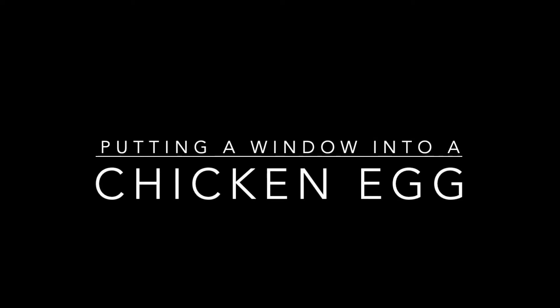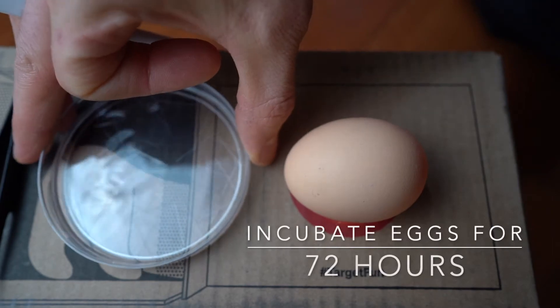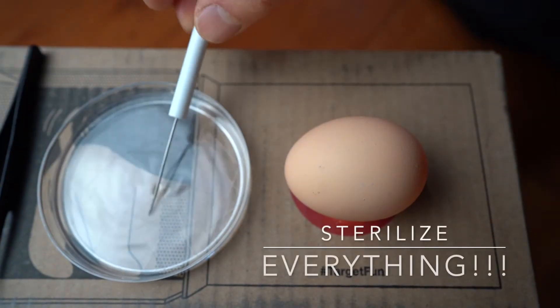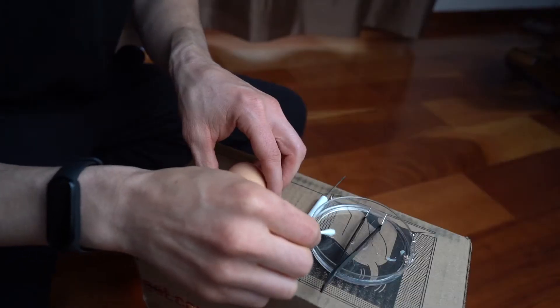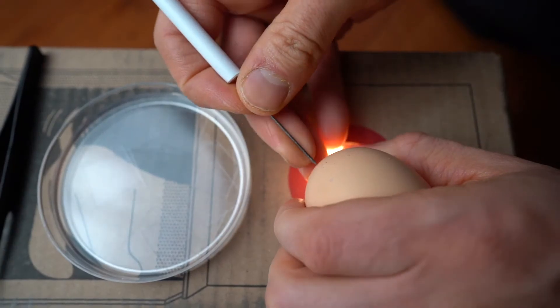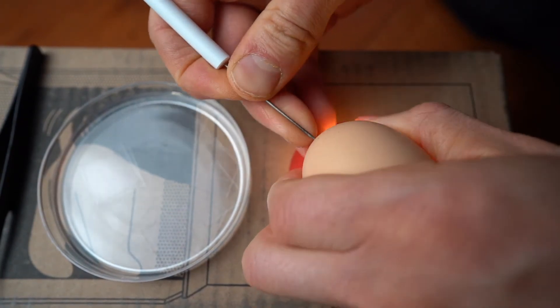Today we are going to put a window into a chicken egg. I'm getting eggs that are 72 hours old and then I'm going to sterilize everything. The liquid I have here is just rubbing alcohol and I put everything in that. Now I'm going to sterilize the back end of this egg where the little air sac is.